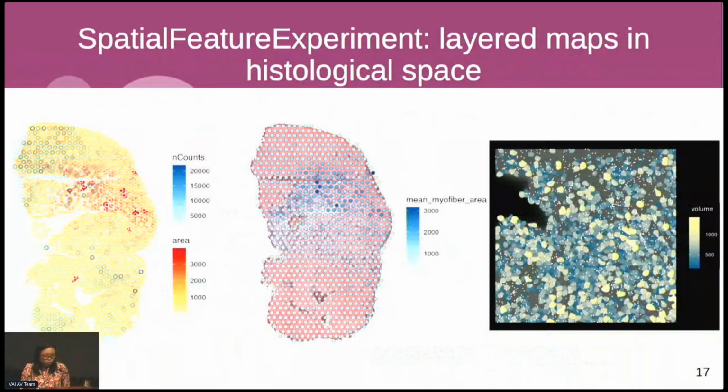So a spatial feature experiment, we can think of it like a layered map. This is a Visium dataset from mouse skeletal muscle. We can have a raster layer for the H&E image, and vector layers for the polygons of the Visium spots and for the myofibers.